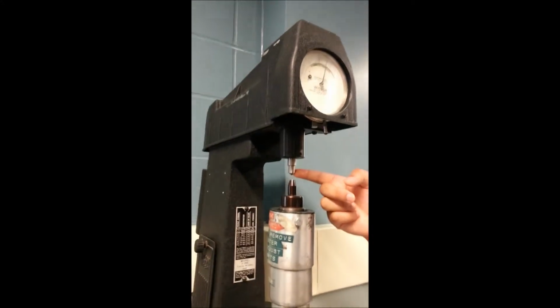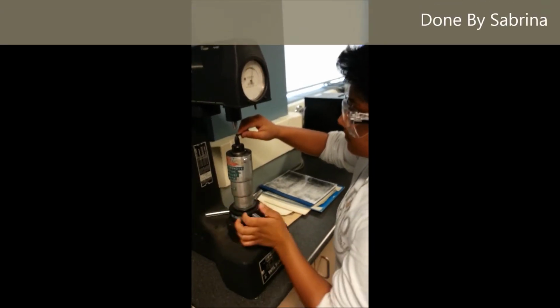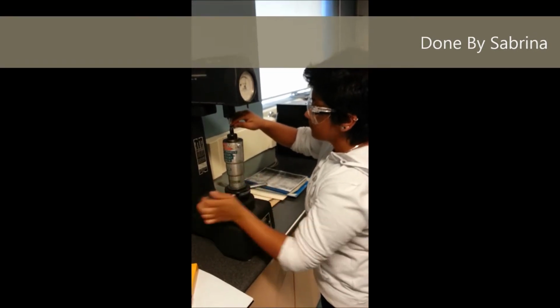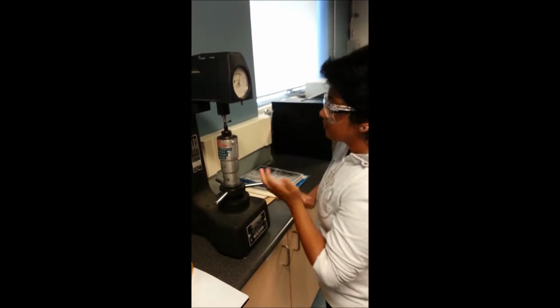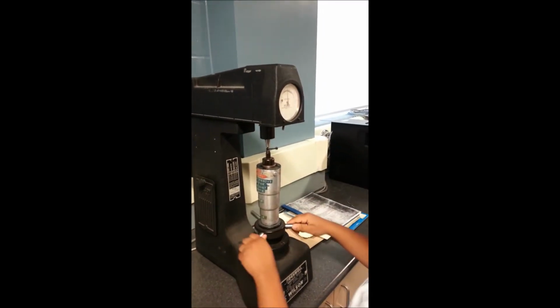Since steel is a softer metal, for its hardness we use the round anvil. The specimen being demonstrated is the quenched sample. We then turned the capstan wheel to elevate the sample. We positioned it to allow us to take the reading on the edge of the sample.